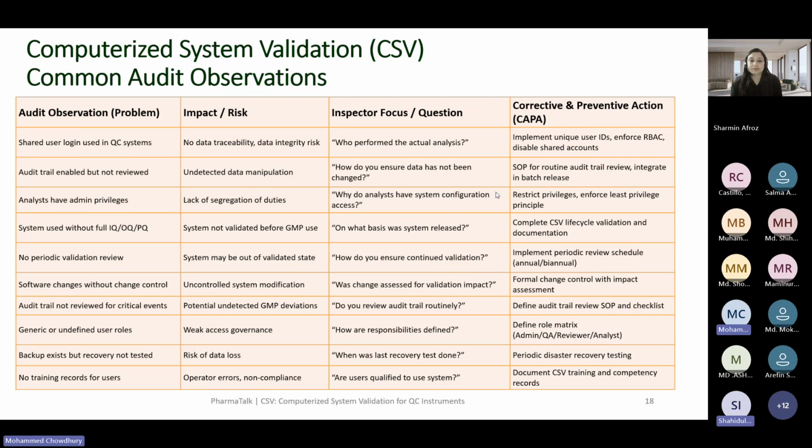If it is not possible in this system, then put procedural and administrative control in place. And IT admin should be assigned to someone who can understand these recipe creation procedures.